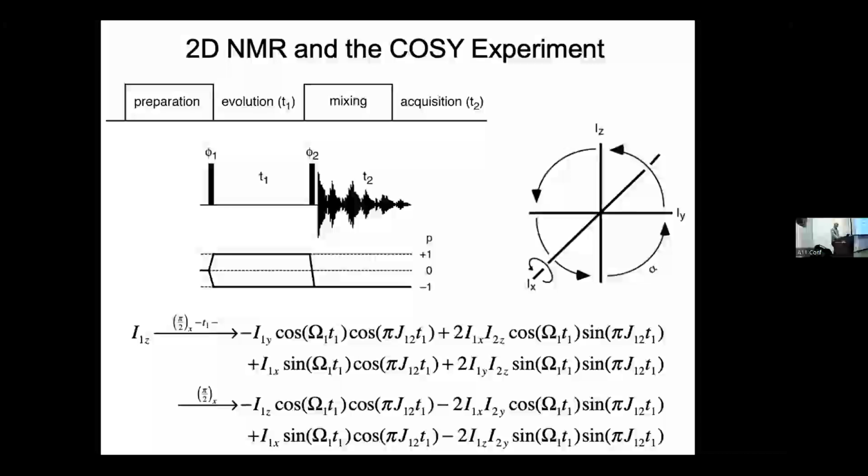But that's arbitrary. I can always apply a 90-degree phase correction, in which case IY turns into the absorptive line and IX becomes the dispersive line. In this particular case, all I have to do is multiply the signals by minus i, and the i turns into a 1, and the X turns into a minus i.